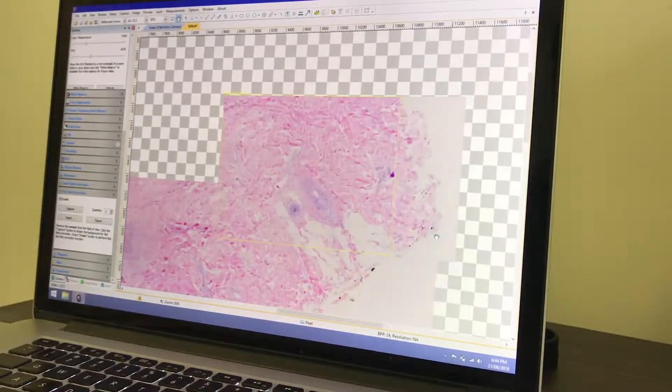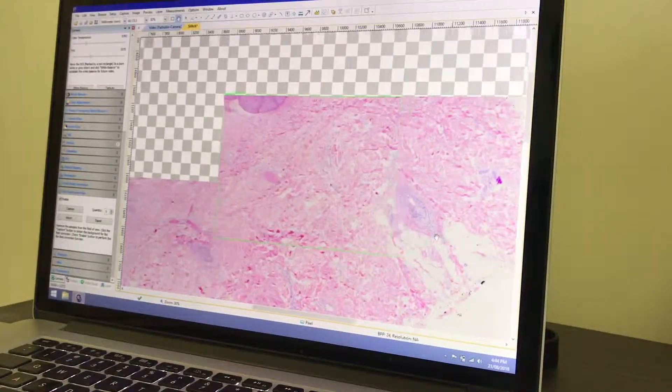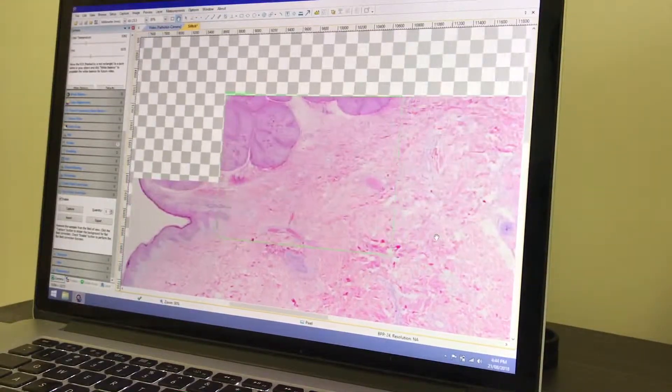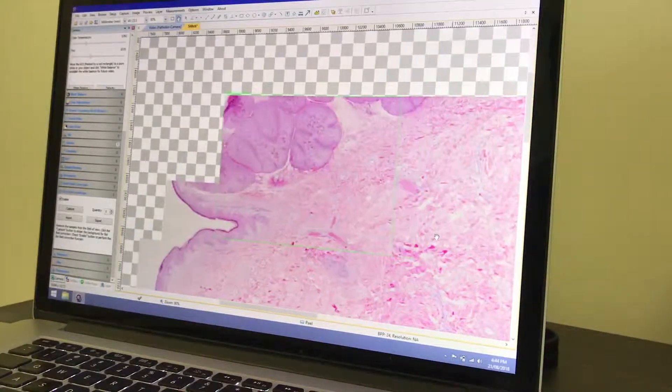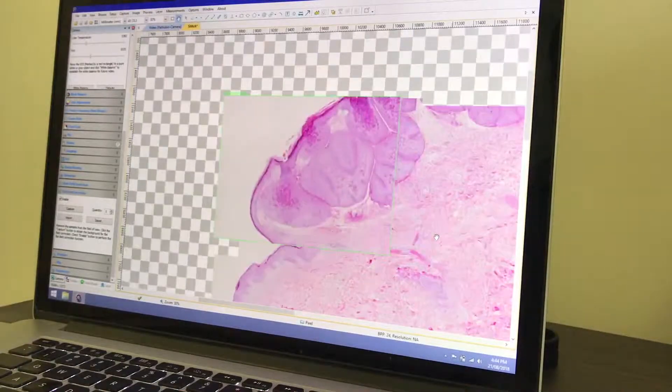In this example I'm using the 4x objective lens on my microscope. You can use any power objective, but obviously the higher the power, the longer it will take to cover your specimen, and the bigger your output image will become.